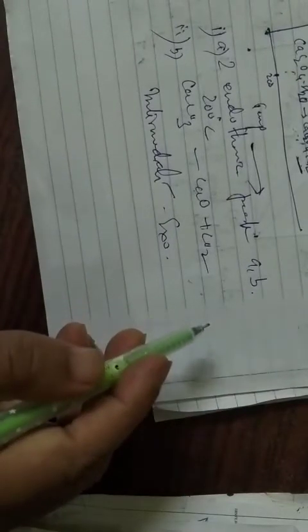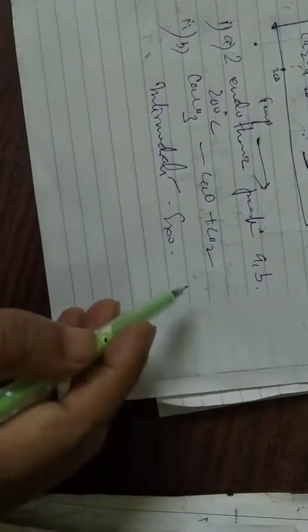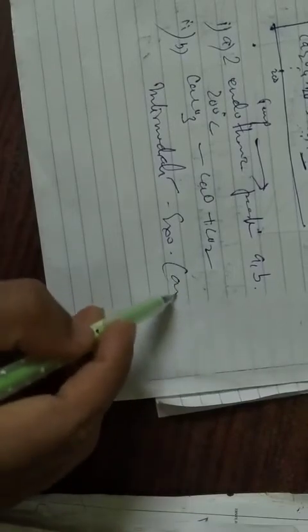Now what is this C? The C is an intermediate, an exothermic process in the presence of oxygen from the air, that is oxidation, because we are doing this in the presence of oxygen.